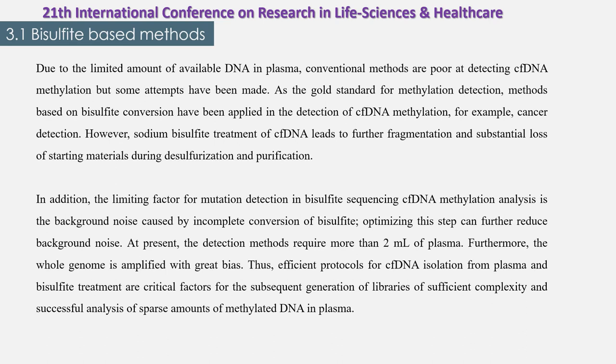Thus, efficient protocols for cell-free DNA isolation from plasma and bisulfite treatment are critical for the subsequent generation of libraries of sufficient complexity and successful analysis of sparse amounts of methylated DNA in plasma.